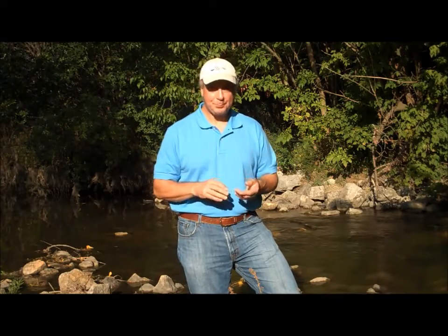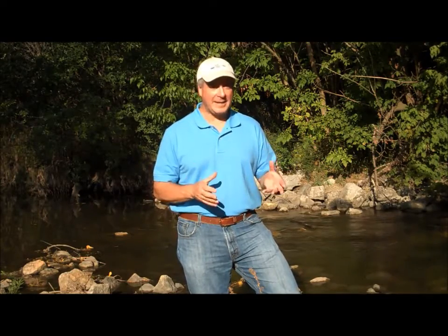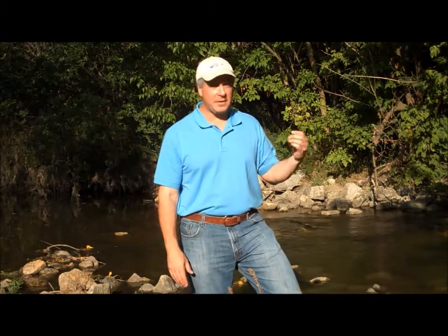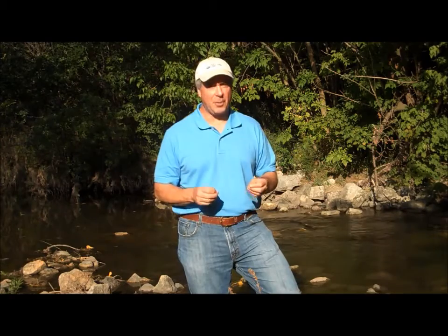And we also wear latex gloves to protect our hands from contact with the river water. Over the past 13, 14 years that we've collected data, we've noticed that the bacteria count can be very high in this river. Therefore, we want you to make sure that you're protected against that. So we give you gloves, and you actually bought the goggles to wear, and we expect you to wear them while we're at the river.